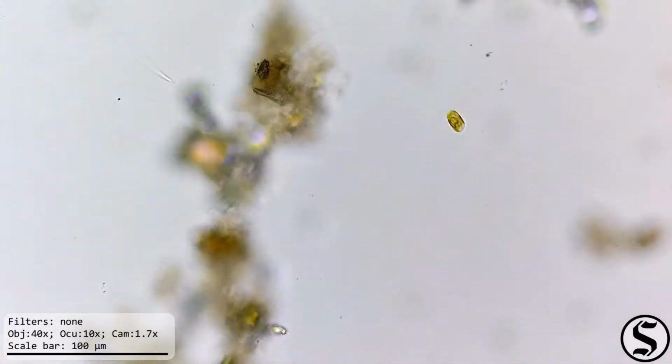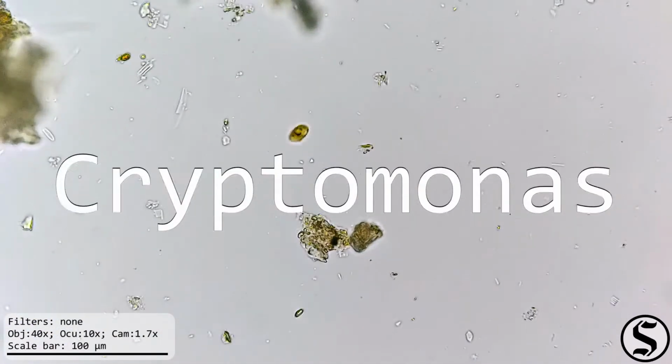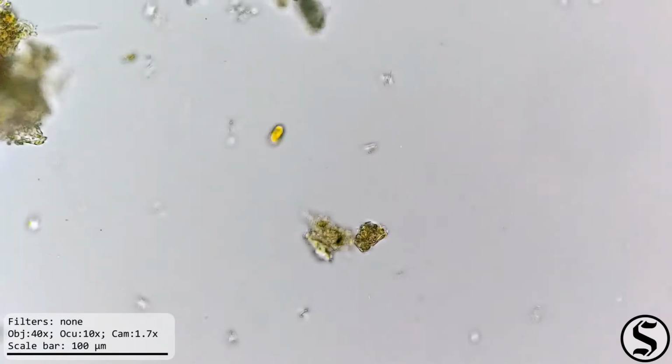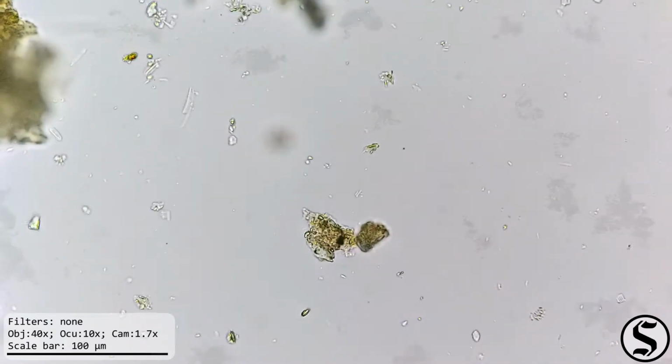Well, under high magnification, these look like cryptomonas. That comes from the Greek kryptos for hidden or secret, and monas for unit. And these are flagellated algae.